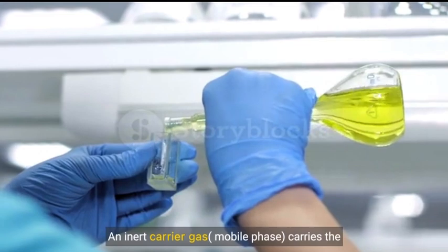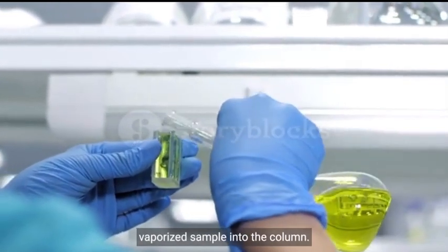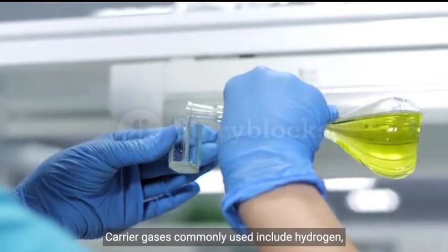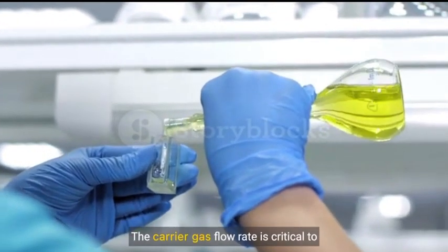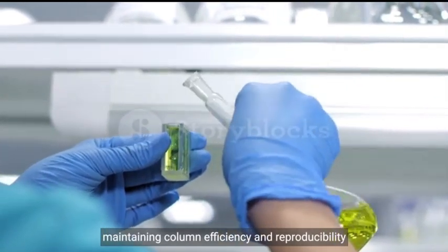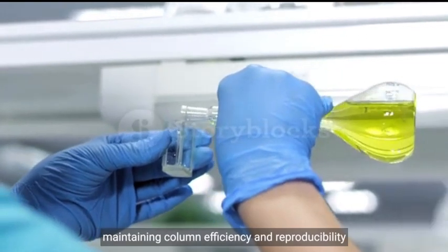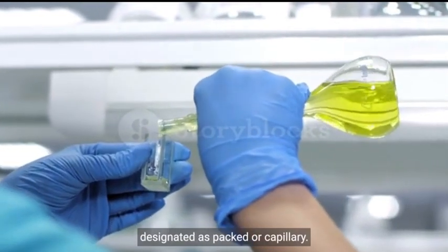An inert carrier gas, mobile phase, carries the vaporized sample into the column. Carrier gases commonly used include hydrogen, helium, nitrogen, and argon. The carrier gas flow rate is critical to maintaining column efficiency and reproducibility of elution times. The types of columns, stationary phase, used are designated as packed or capillary.